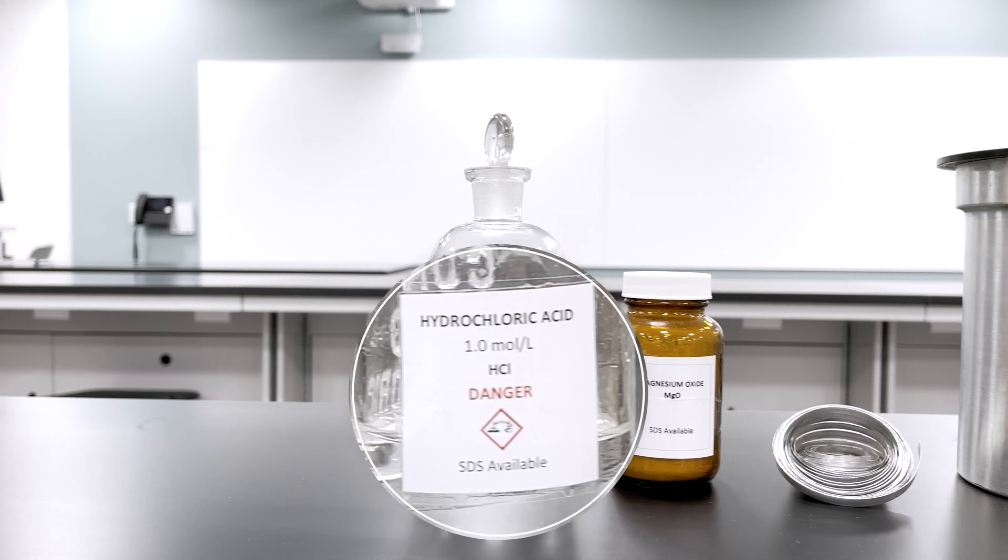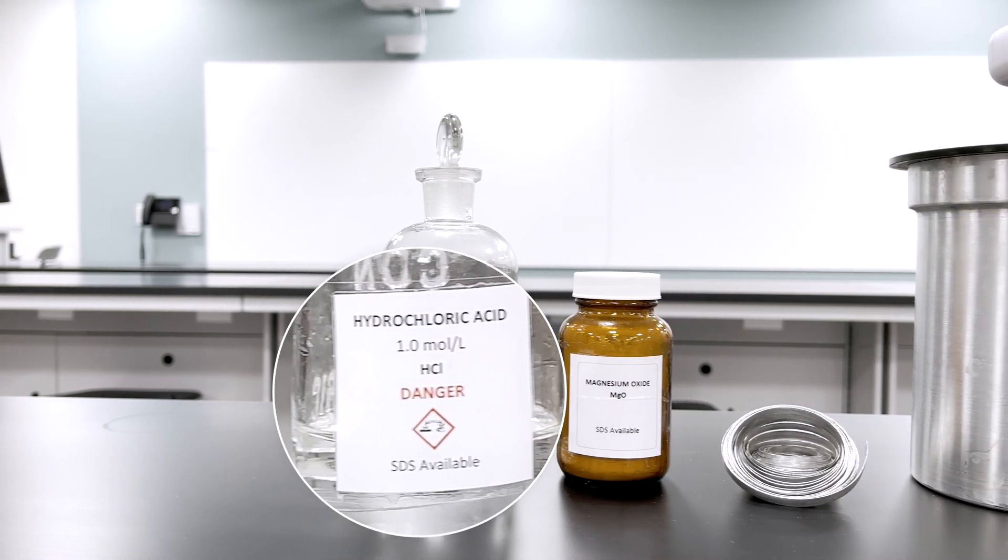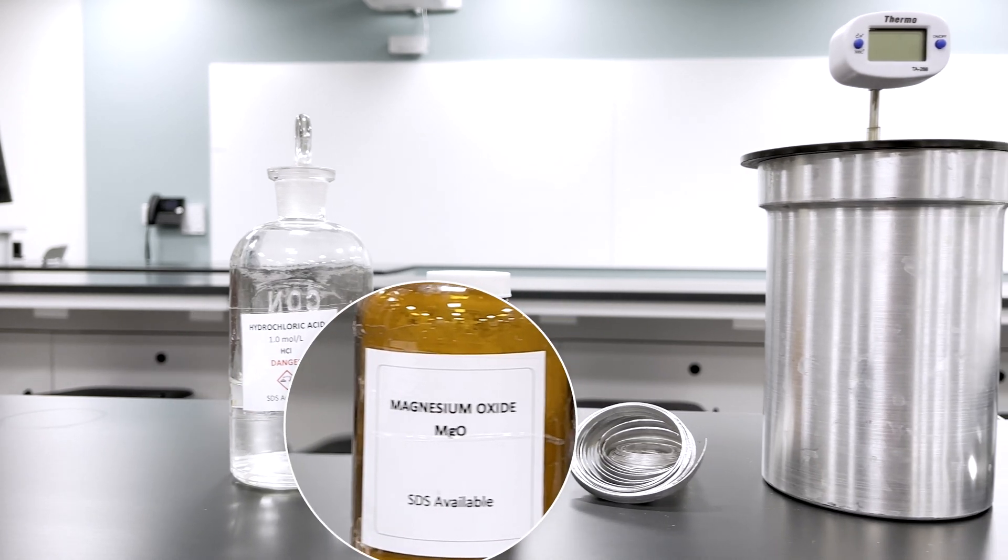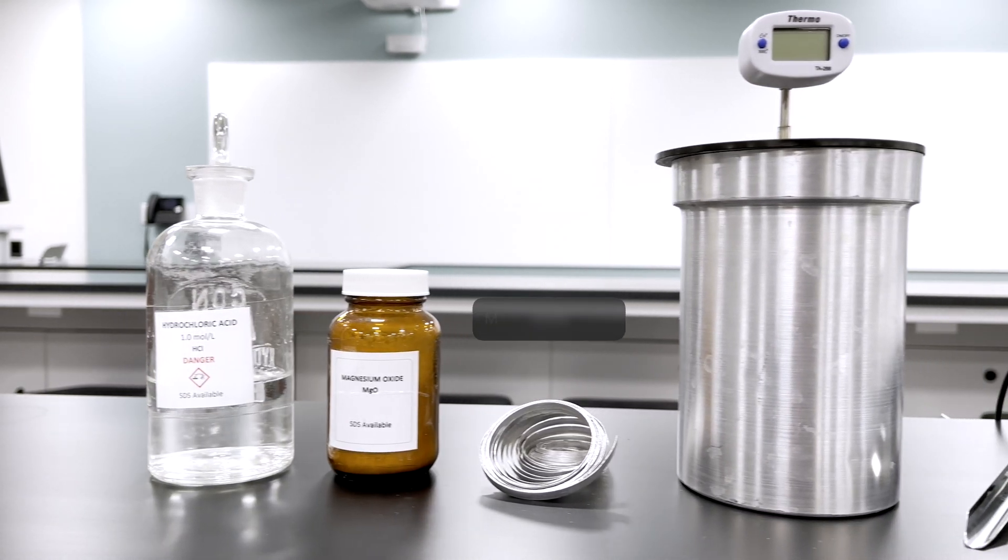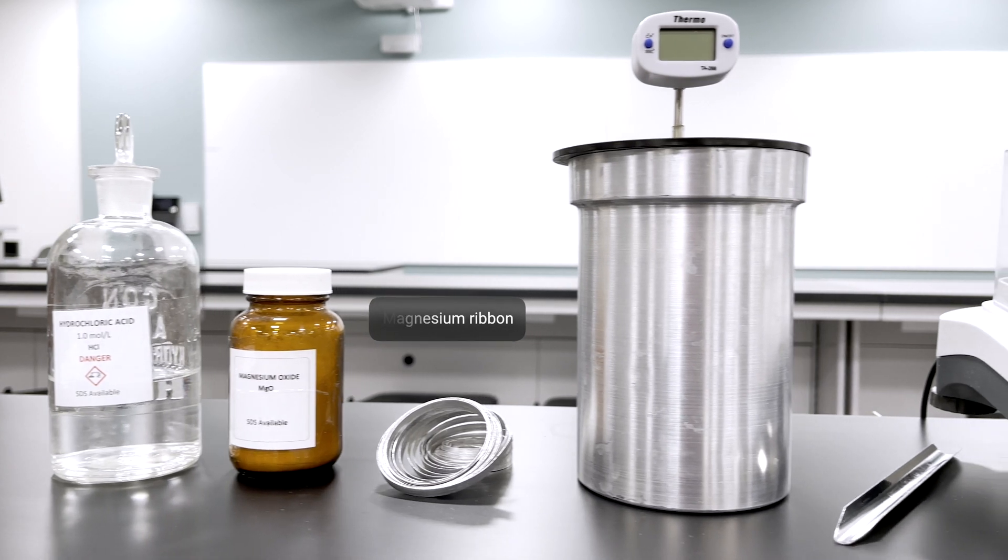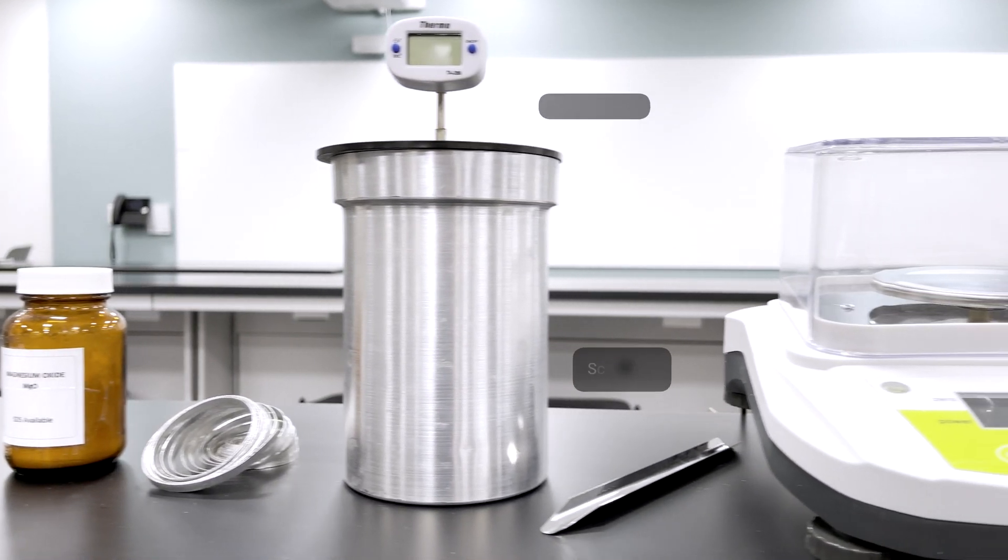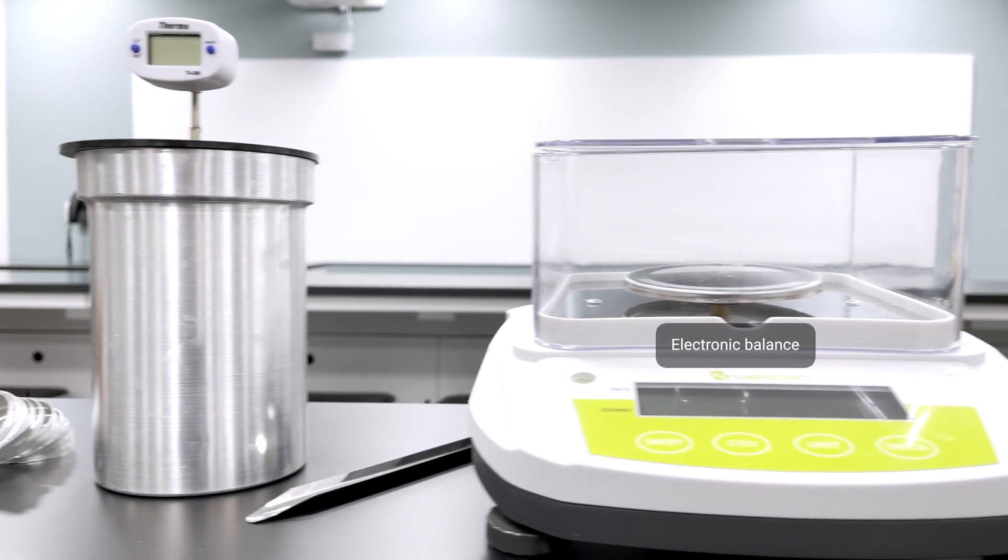The materials we shall use are: a 1 molar solution of aqueous hydrogen chloride, magnesium oxide powder, magnesium ribbon, a simple calorimeter with a thermometer, a spatula, an electronic balance, sandpaper, and a 100 milliliter graduated cylinder.